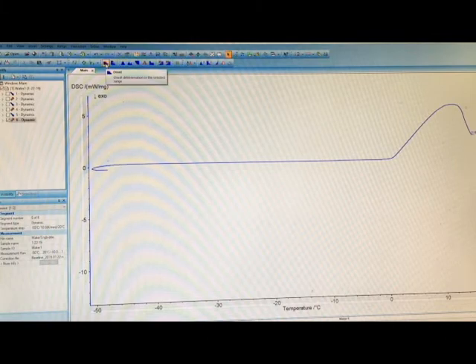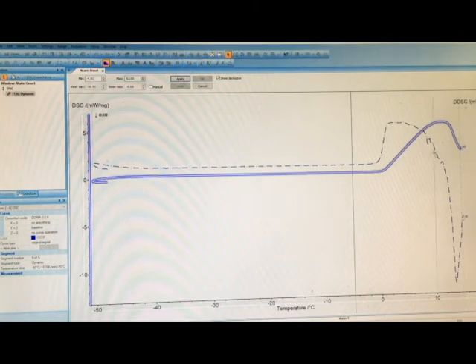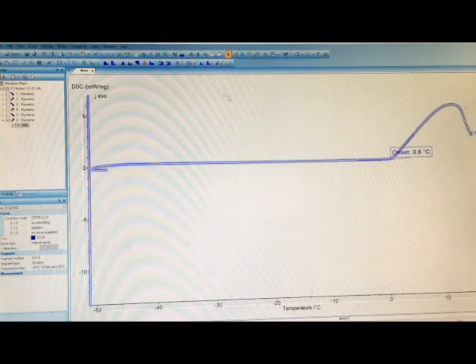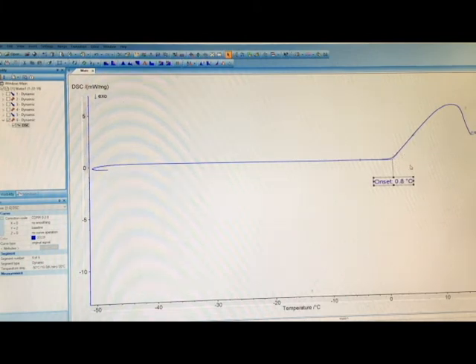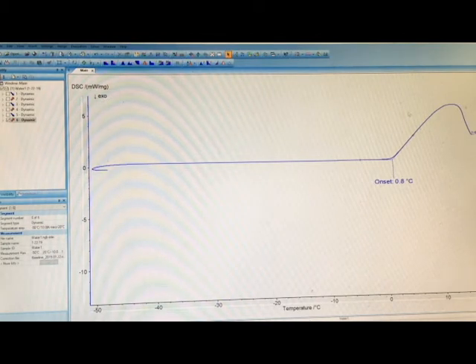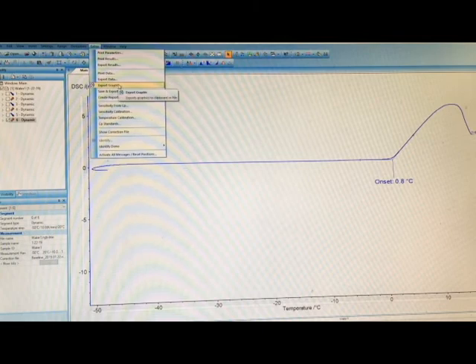I'm going to identify the onset of this event because I want to know when the melting started to happen. I'll use the black lines to highlight my area of interest — staying on the flat baseline on the left, and going up to the peak of the event on the right. Click Apply then OK, and that will identify my onset. My onset here is 0.8 degrees Celsius, which is a little different from what you'd expect water to melt at, but really not much of a delay.